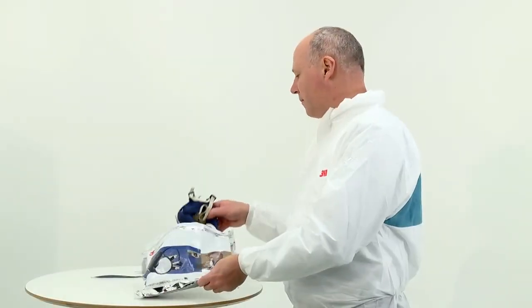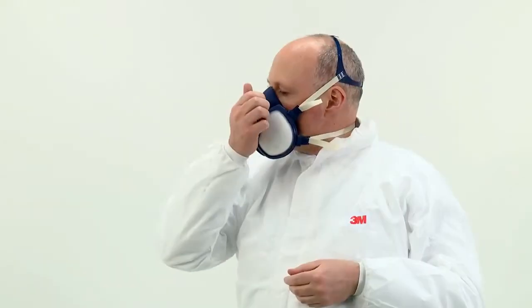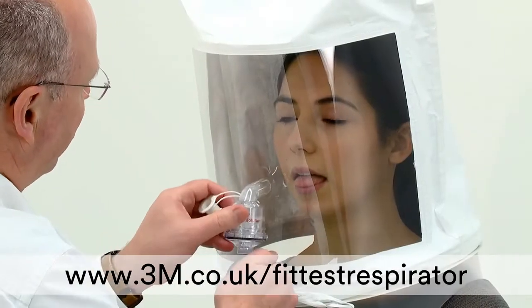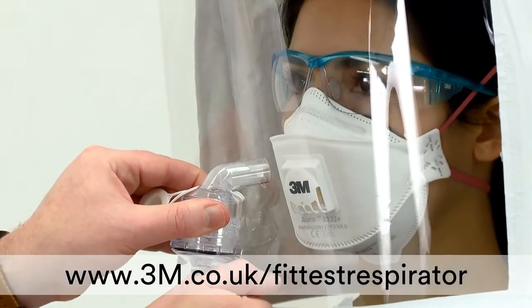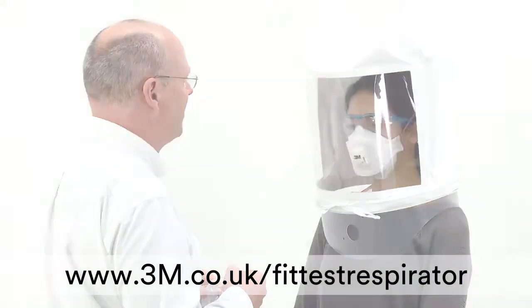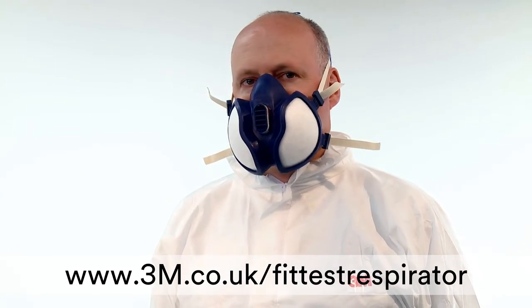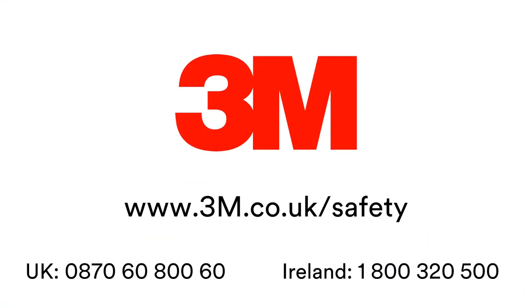The performance of your respirator relies on an adequate seal between the respirator and your face to ensure contaminated air does not leak in. The method of measuring whether or not you have an adequate seal is to pass a face fit test. Fit testing should not be confused with a pre-use fit check, which should be conducted every time you use your respirator. For more information on fit testing, please visit www.3m.co.uk/fit test respirator.